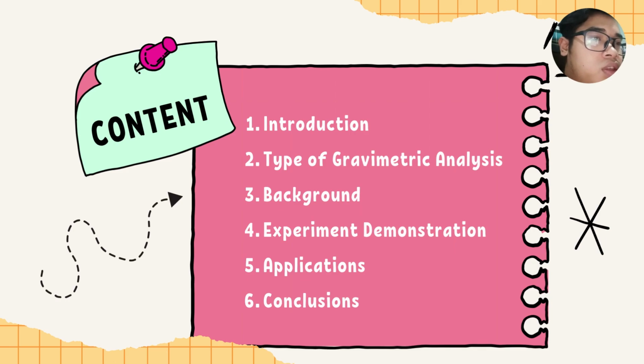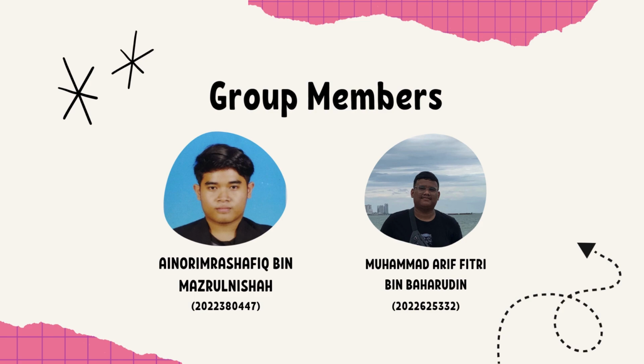This video presentation covers, first, the introduction, then the types of gravimetric analysis, background, experiment demonstration, application, and conclusion.